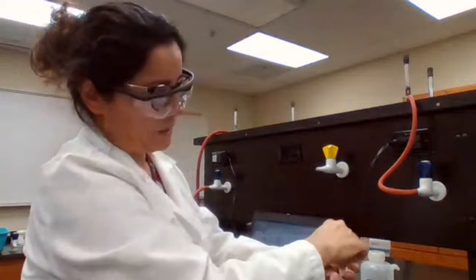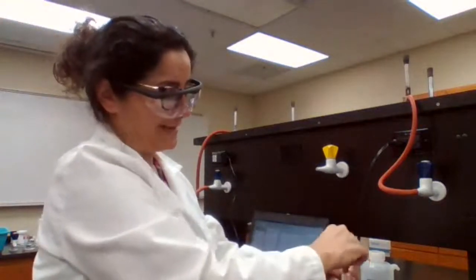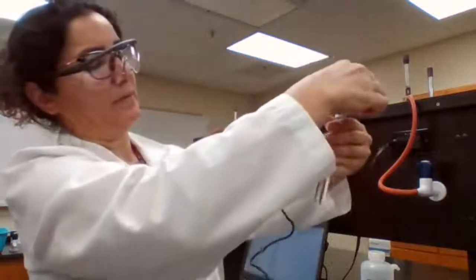Sometimes when the temperature is low and it doesn't form crystals, you can see the crystals, but I don't know, is the seeding effect or is the temperature? The temperature has to be lower.